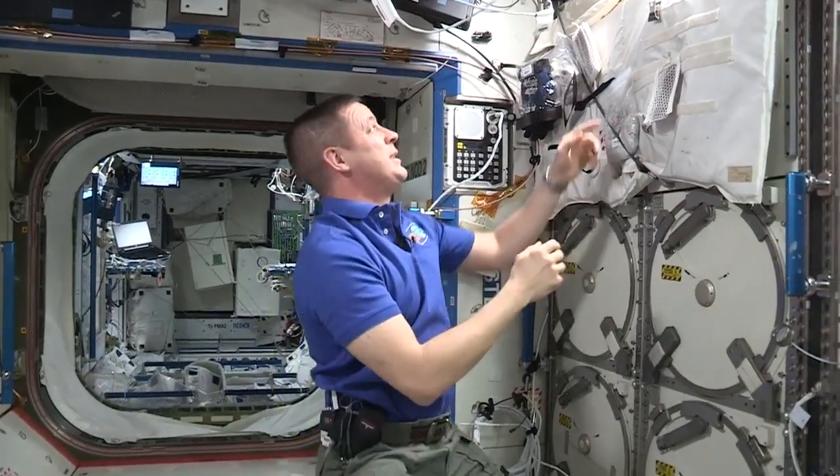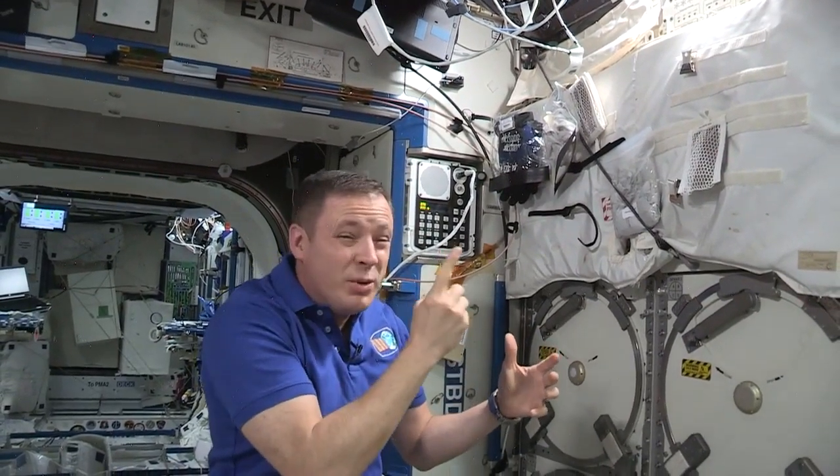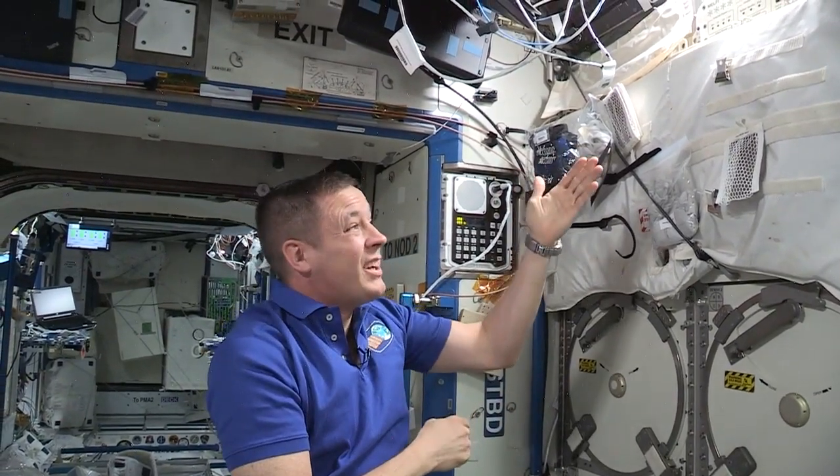The space station is for science and we want to get all these samples we take back down to the ground. To do that we need a big freezer and that's why we have this baby. It uses a Brayton cycle with a wee little motor spinning at 87,000 rpm — that's fast — to get these freezers down to almost 100 degrees below zero.